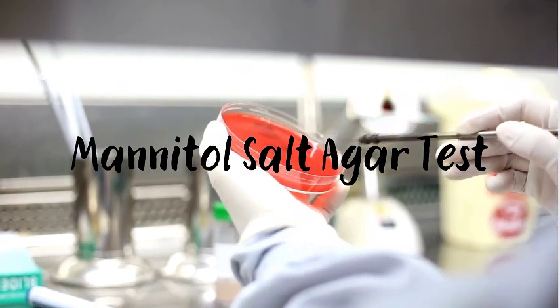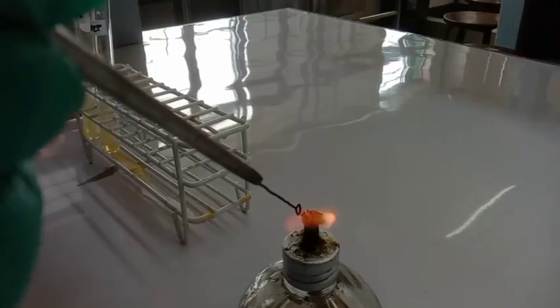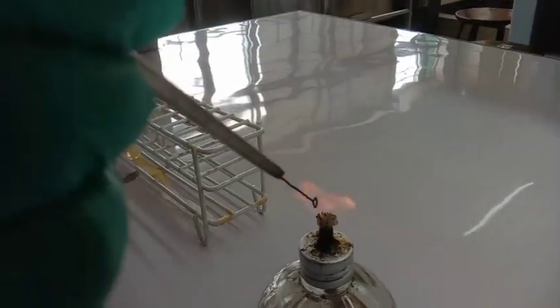An additional test is the mannitol salt agar test. This is to identify whether an organism is a mannitol fermenter or not.